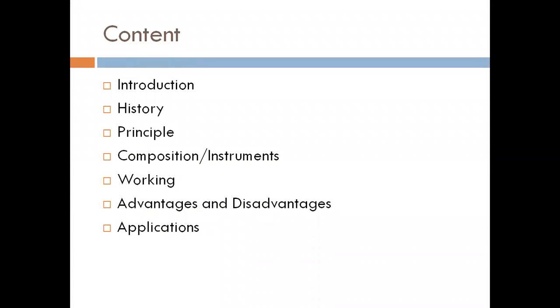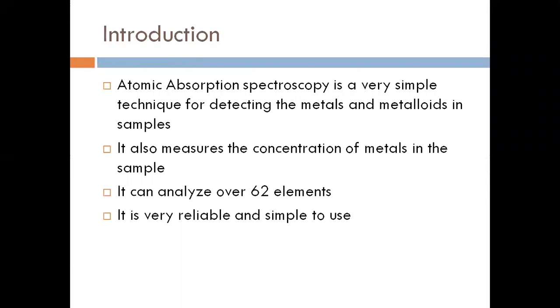Content: Introduction, History, Principle, Composition or Instruments, Working, Advantages and Disadvantages, Application.